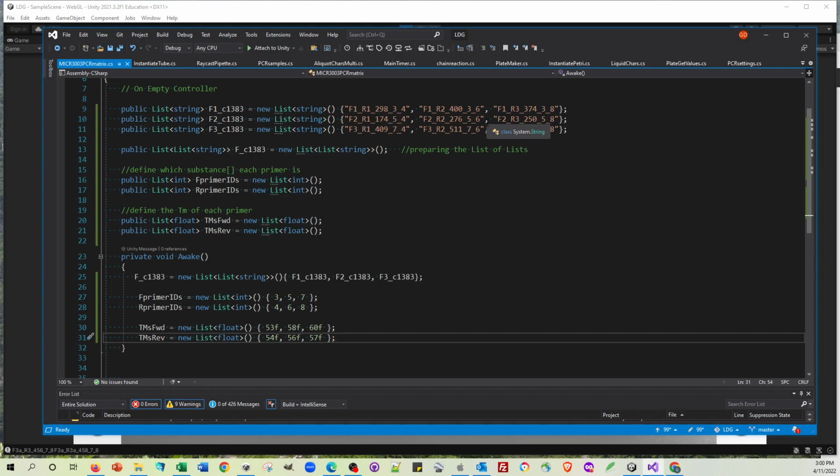So not talking about making this something that does any bioinformatics, but something that responds to intel that you've got from a dedicated primer design or primer exploration sort of site. So those are the advances that are made. Those are the next steps. And yeah, pretty pleased about the way this week's work has gone.